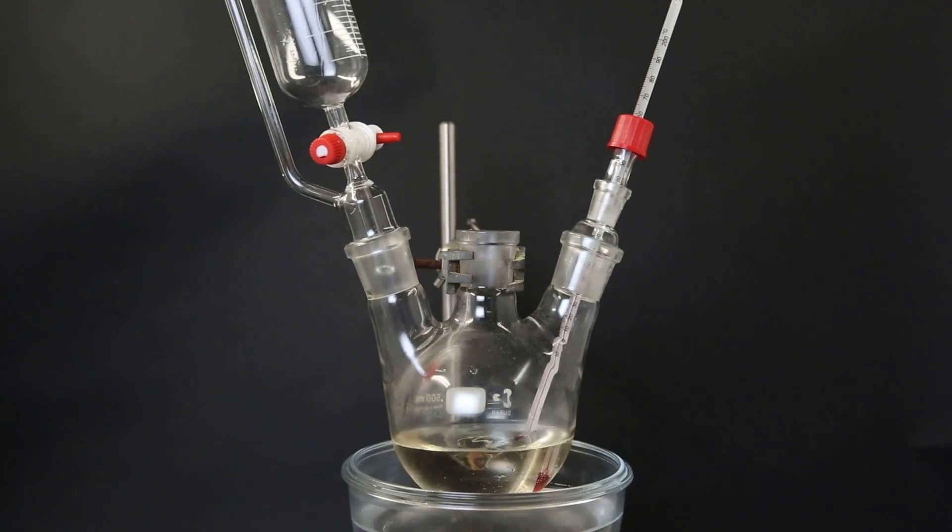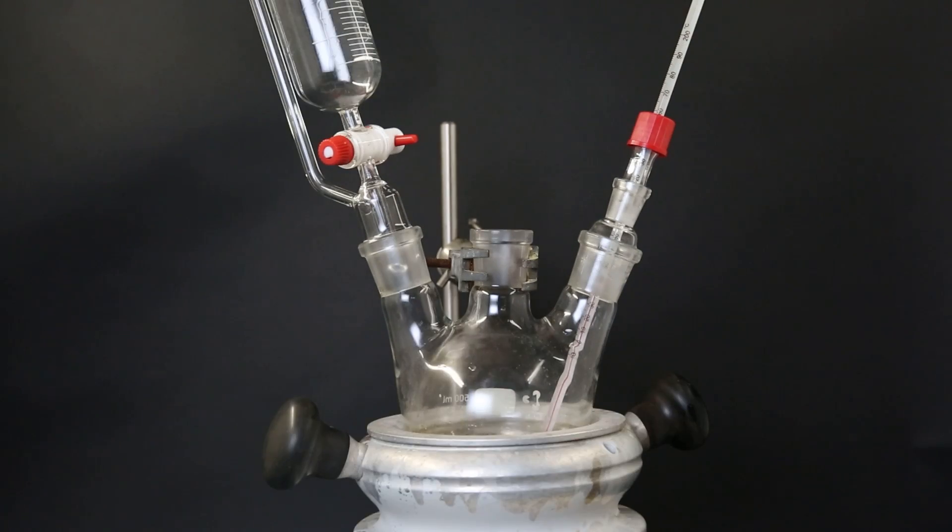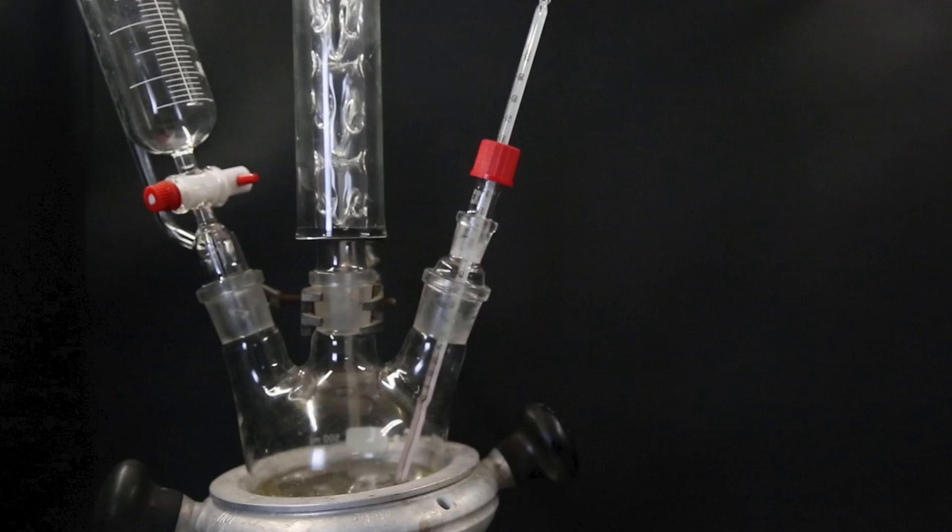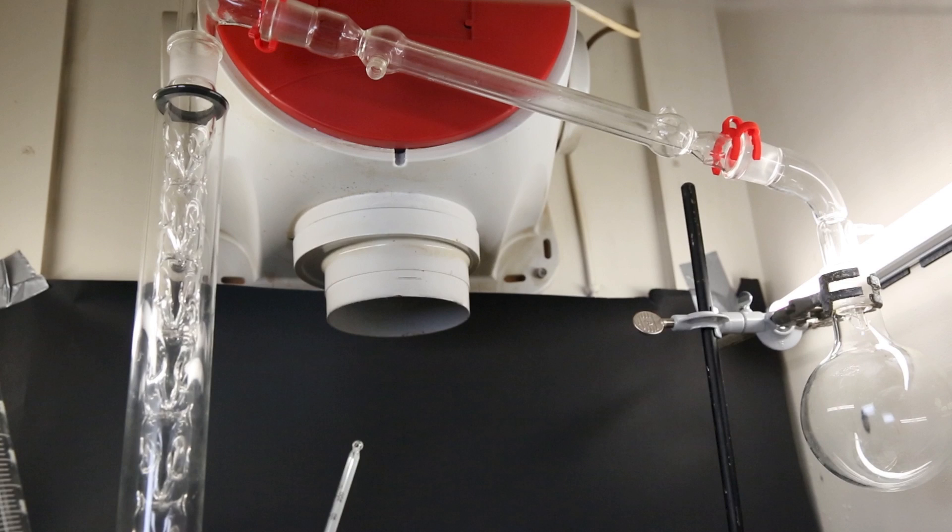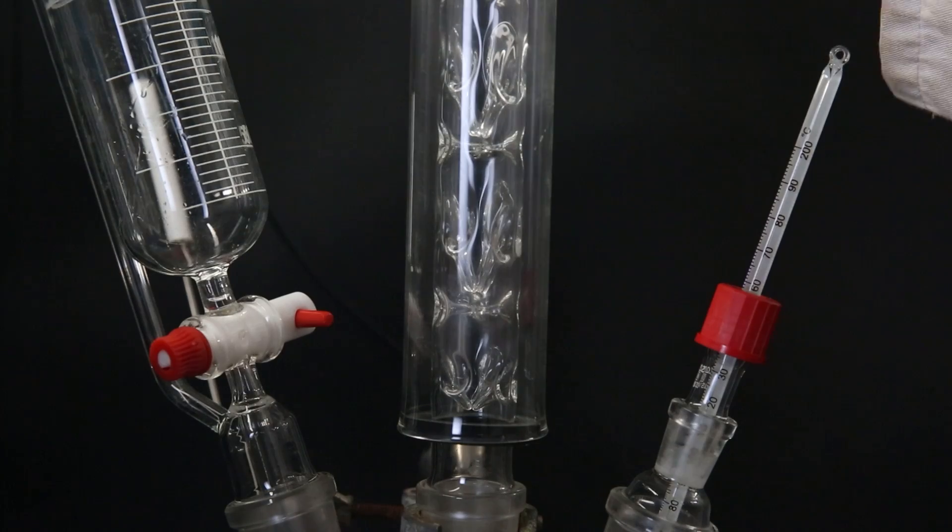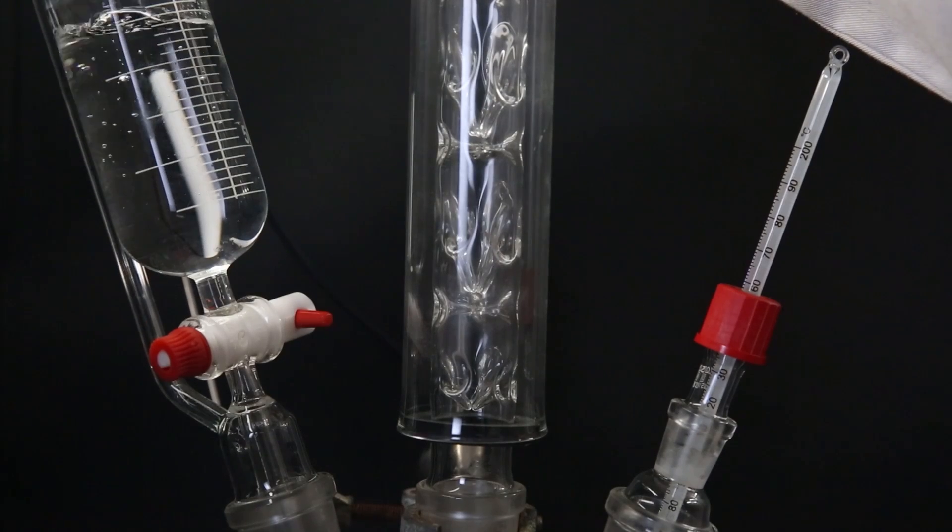When the addition is finished, I remove the ice bath and add a heating block. Now I set it up for a fractional distillation. And this is what the setup looks like. I turn on the heating and add 250 ml of ethanol to the addition funnel.